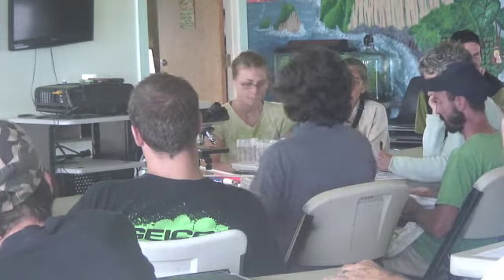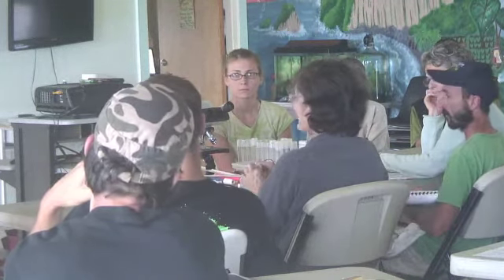Now I'm going to go up here and clean my eyepieces, and know that your eyepieces come off. So it's maybe real easy for you to clean this. And clean the other one. You want to leave the microscope open to dusty, dirty air as little as possible, because it's when dust gets down in the middle of your microscope that you're going to have to take it to somebody to clean it.